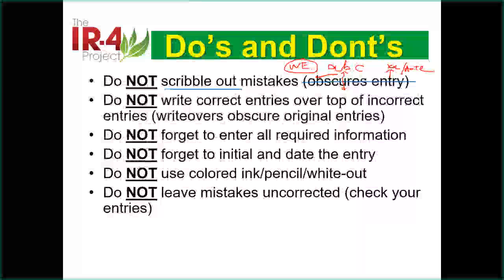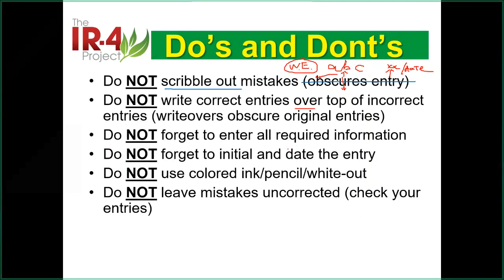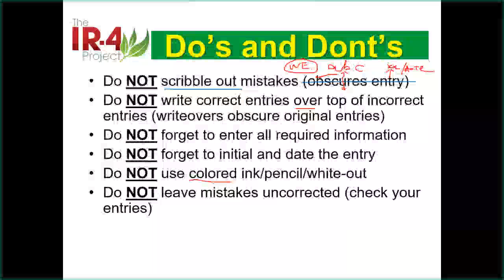Okay. So these are all saying here, put it on the top, or all those things. Okay. So use permanent ink. And also in older days, it's difficult to tell whether this is a photocopy or a scanned copy, so we put the colored ink. It's easier for you to handle that. Even right now, we still use this rule because we still use black and white photocopy.